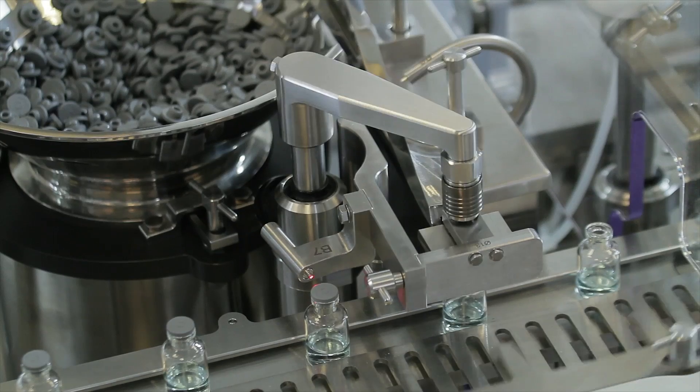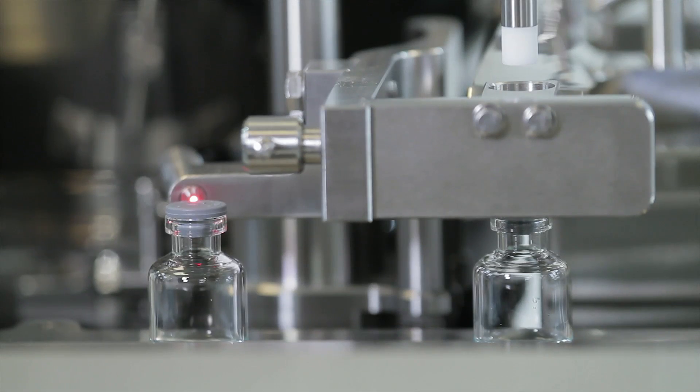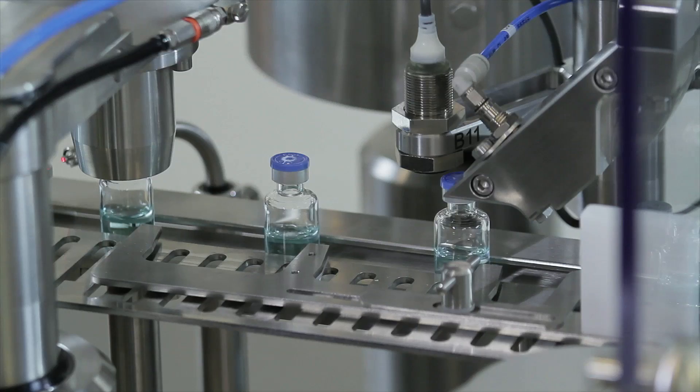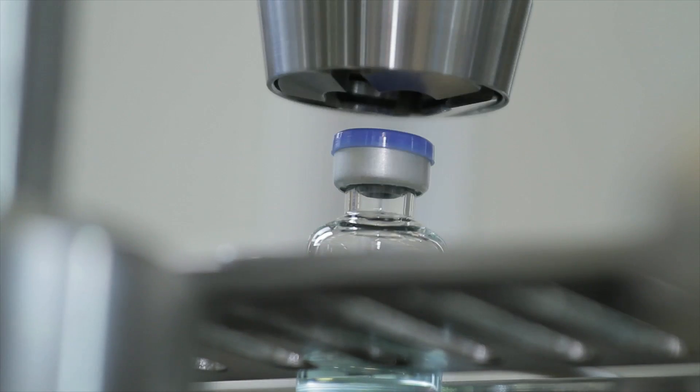Configurable to use a wide range of different size vials, stoppers and caps, your filling line can be configured for a variety of filling tasks, protecting your investment.